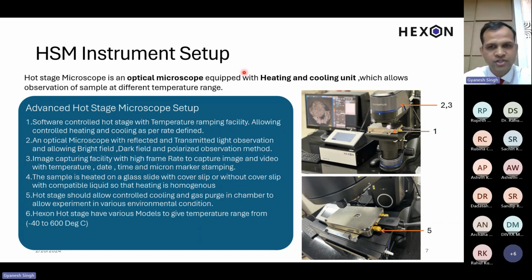Maybe you are going to 100 degrees Celsius, staying there for 10 minutes so that the entire sample reaches 100 degrees Celsius, because there is a glass slide, there are liquids, there are cover slips, so that all of them are homogeneously at the same temperature. And then you go towards maybe 150 degrees Celsius, stay there for 5-10 minutes again, and then you ramp.